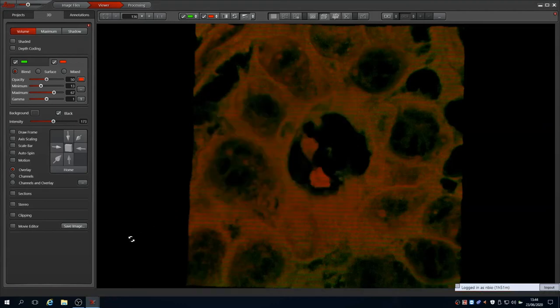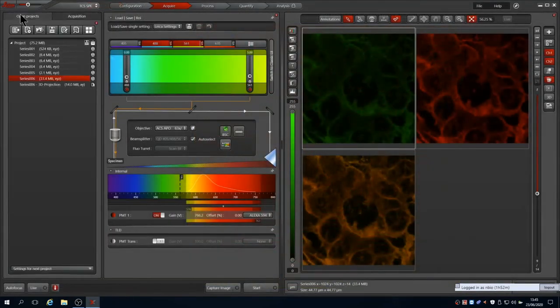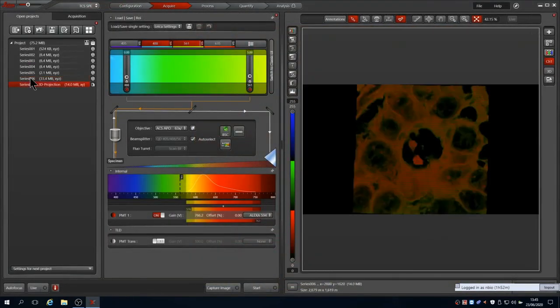Other options such as adding a scale bar are possible. Closing the renderer brings you back to LASX. Any images saved from the renderer to the project can be viewed in here.